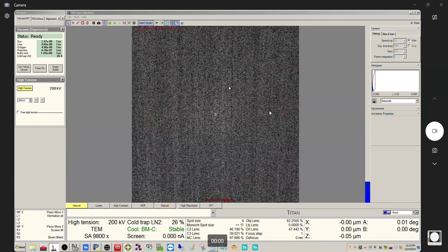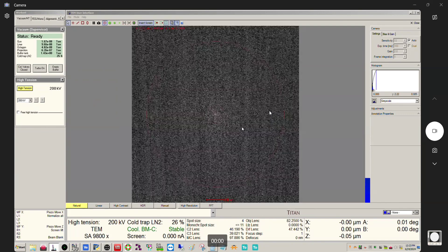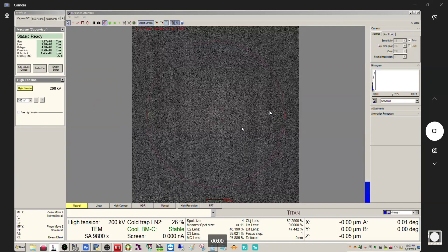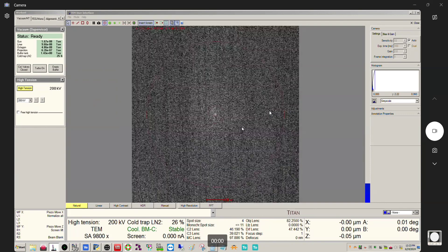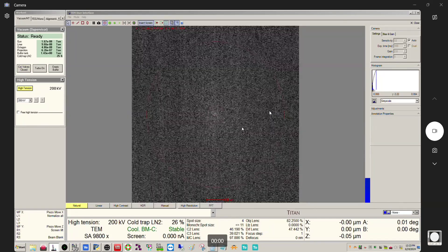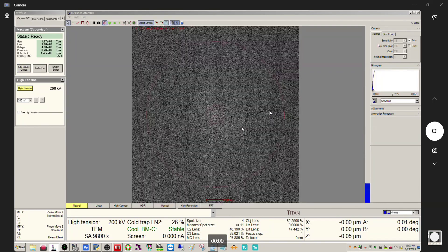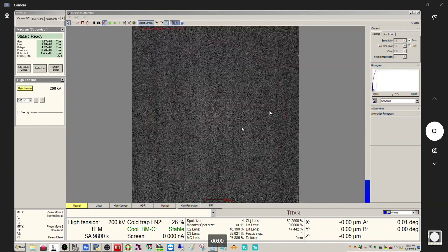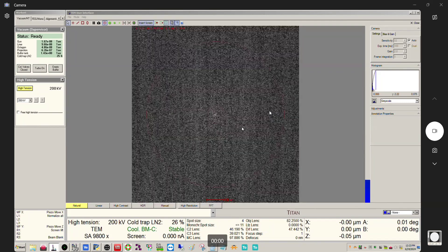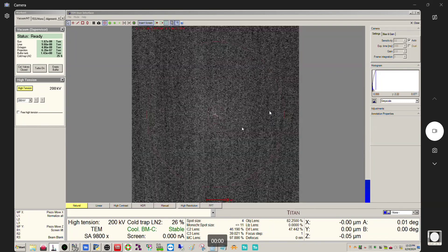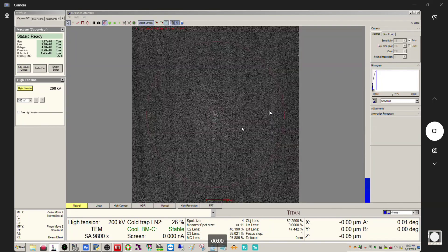And there's nothing there — no beam, no intensity, no image. Why is that? To be clear, this problem basically affects everybody; it's not limited just to new or inexperienced users. But newer users tend to have more of an issue dealing with it because they haven't come across it very much. They see this and think there's something wrong with the microscope — well, there's probably nothing wrong with the microscope.